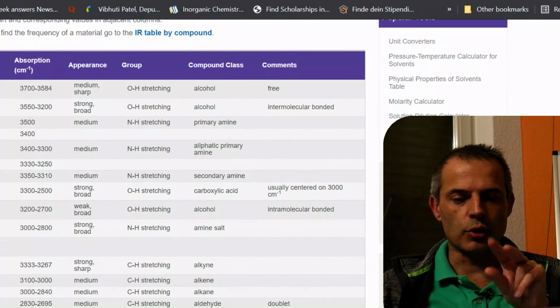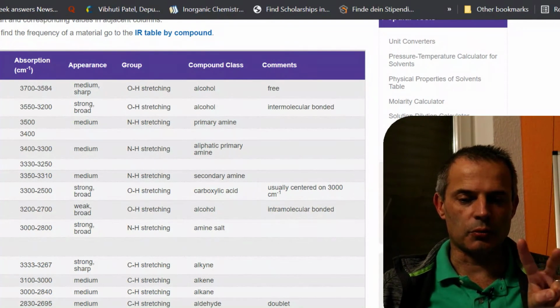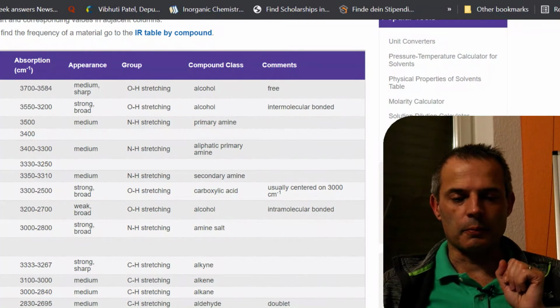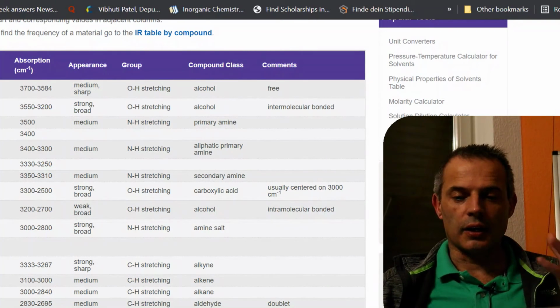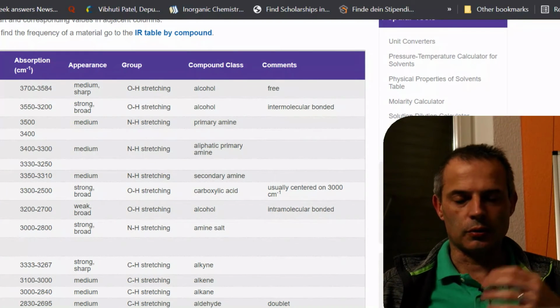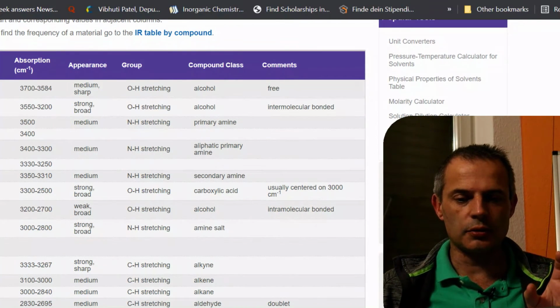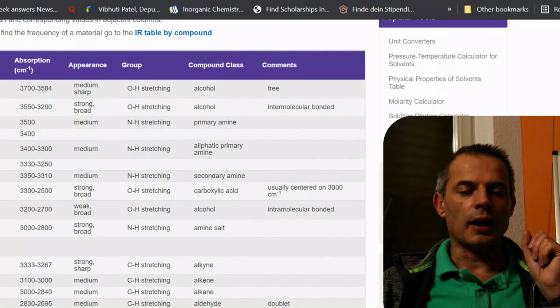So we've got umbrella, where they go like this, because there's 3 of them. And we've got scissoring, which is the equivalent with 2. Then we have stretching, and asymmetric and symmetrical stretch. But what we actually see as strong absorptions is 4 bands, and 2 of them actually overlap, so it looks like 3 usually, but it's actually 4.